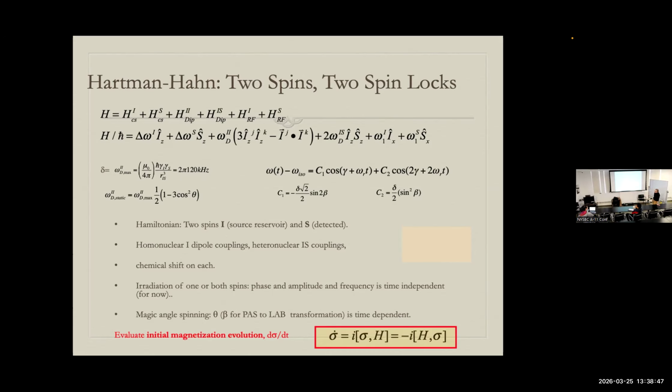I think you justified it with dipolar coupling not in the Z direction being small. Small or big doesn't make it effective or ineffective. Sometimes small things really matter in NMR Hamiltonians, but there is something ineffective about it sometimes. The Z and the Y pieces.